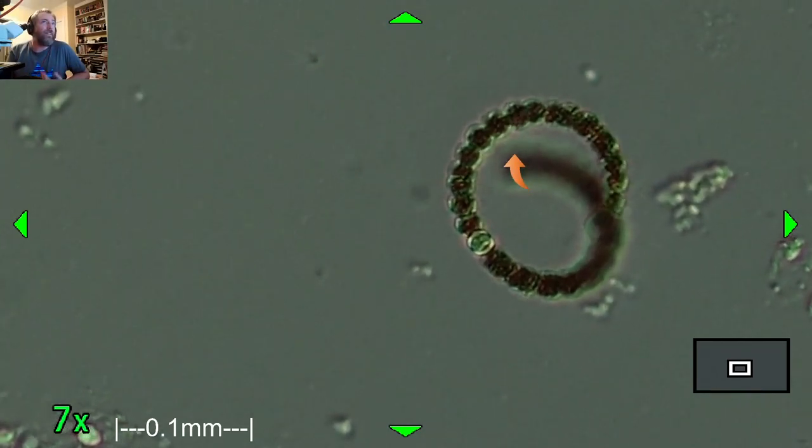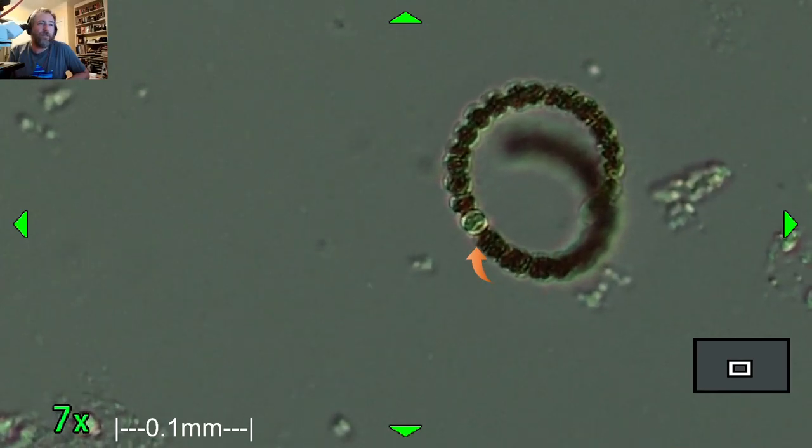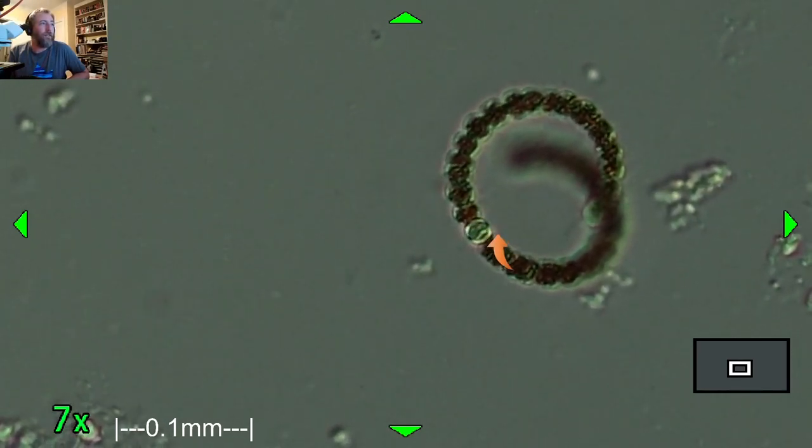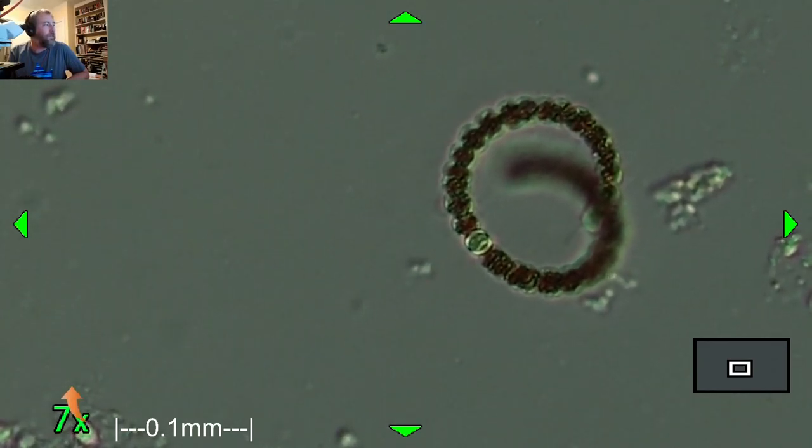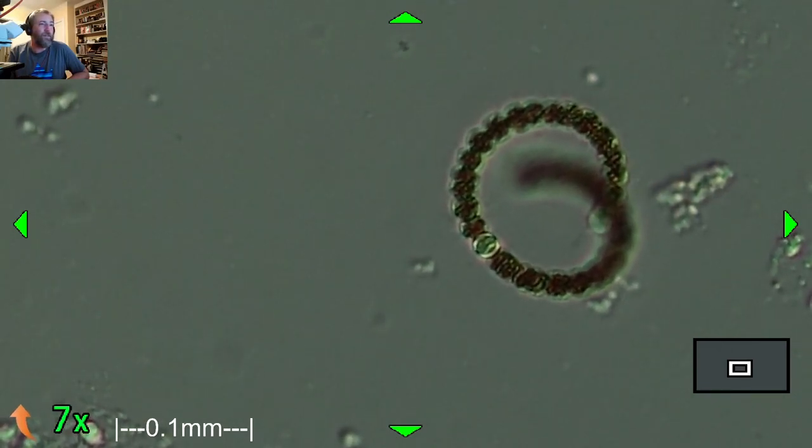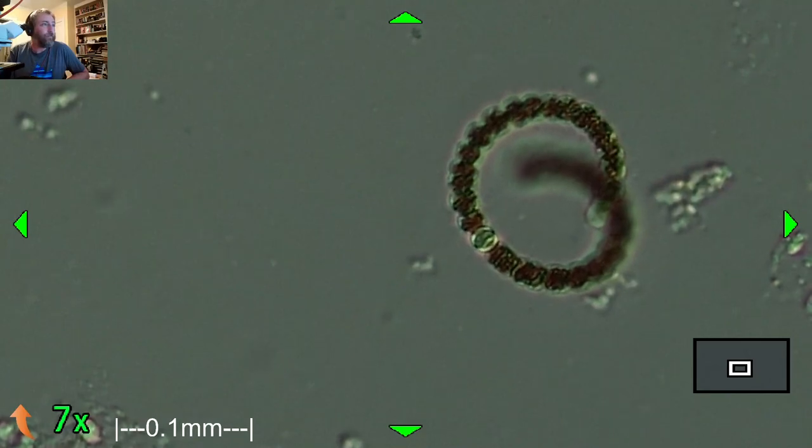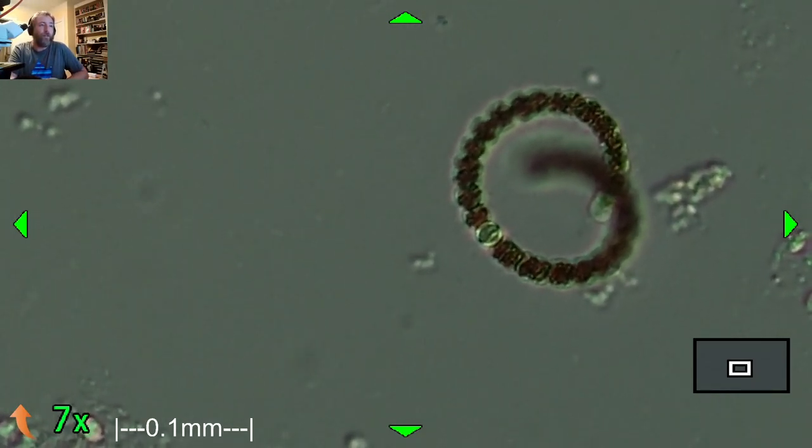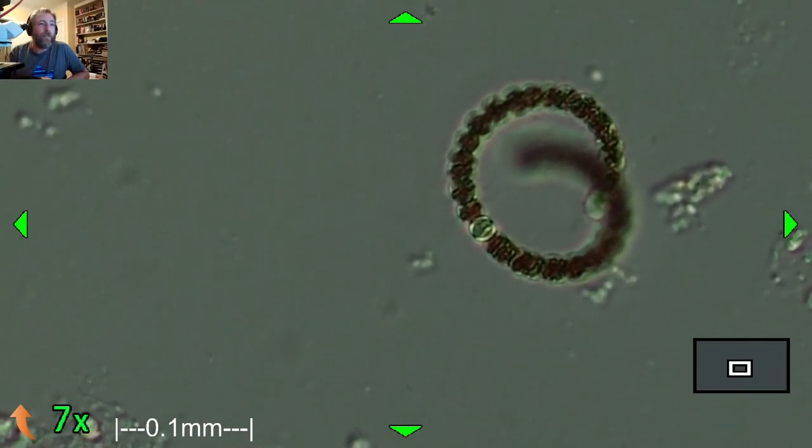So hetero just means different, and cyst just means like a cell. So the cell is different than the rest of them that are on this strand. And that's because it's filled with something called nitrogenase, I think it is, which they use to turn nitrogen gas into nitrates that they can then use for food. And this is a nitrogen-fixing cyanobacteria. And it's one of the marvels of nature, actually.